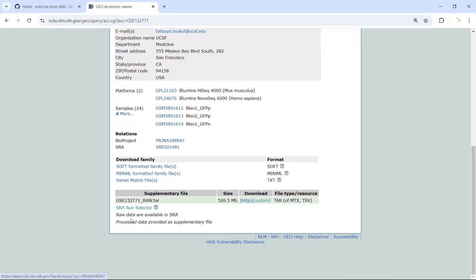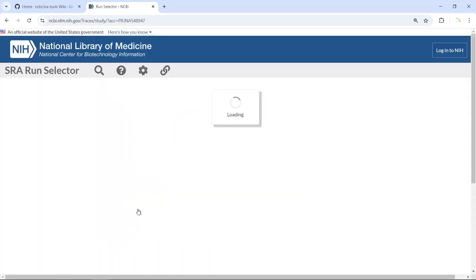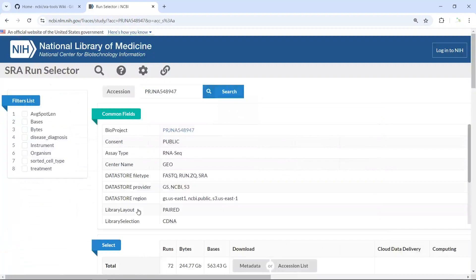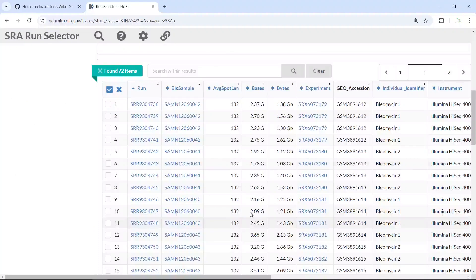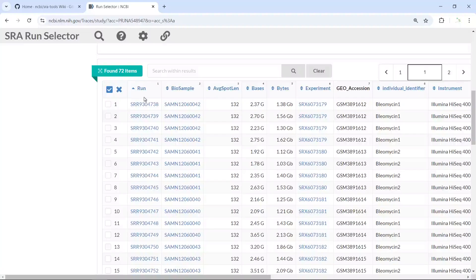You can see down here the raw data are available in SRA. So we can click the SRA run selector. If you click this link, you will find the raw sequencing data. All the raw sequencing data in this dataset are listed here, with the sequencing data for each SRA run.